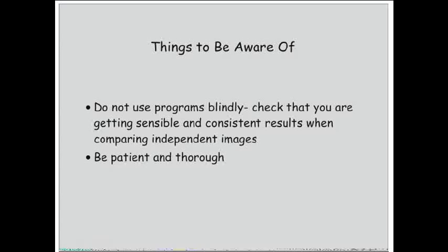And be very patient and very, very thorough. Don't rush it. Just keep checking and making sure that everything makes sense. And then if you're careful enough, you should end up with some good phases that you can calculate a good structure from. And that's where I'll end.